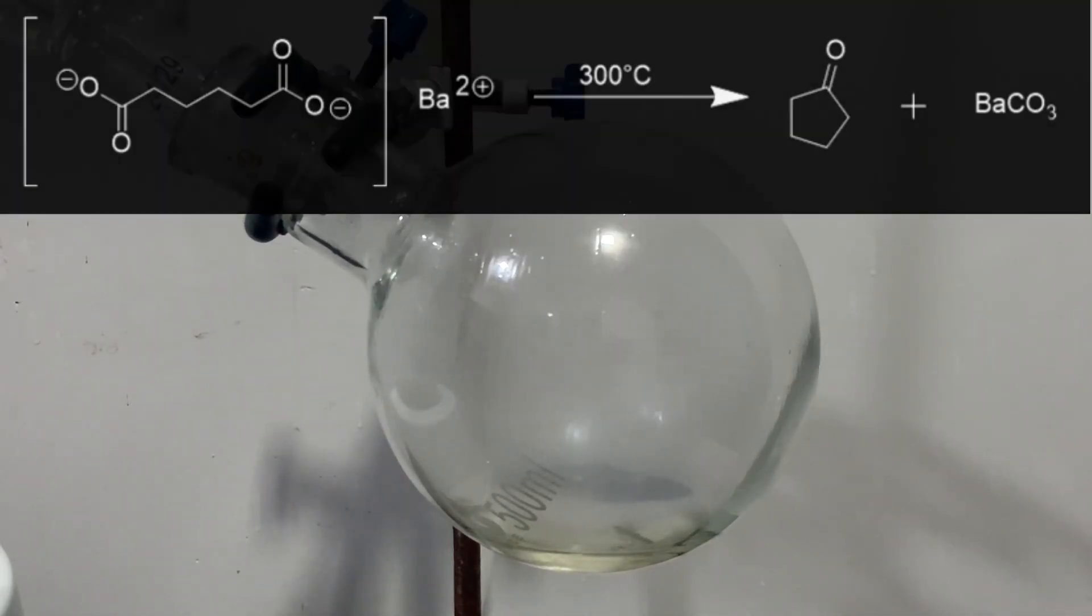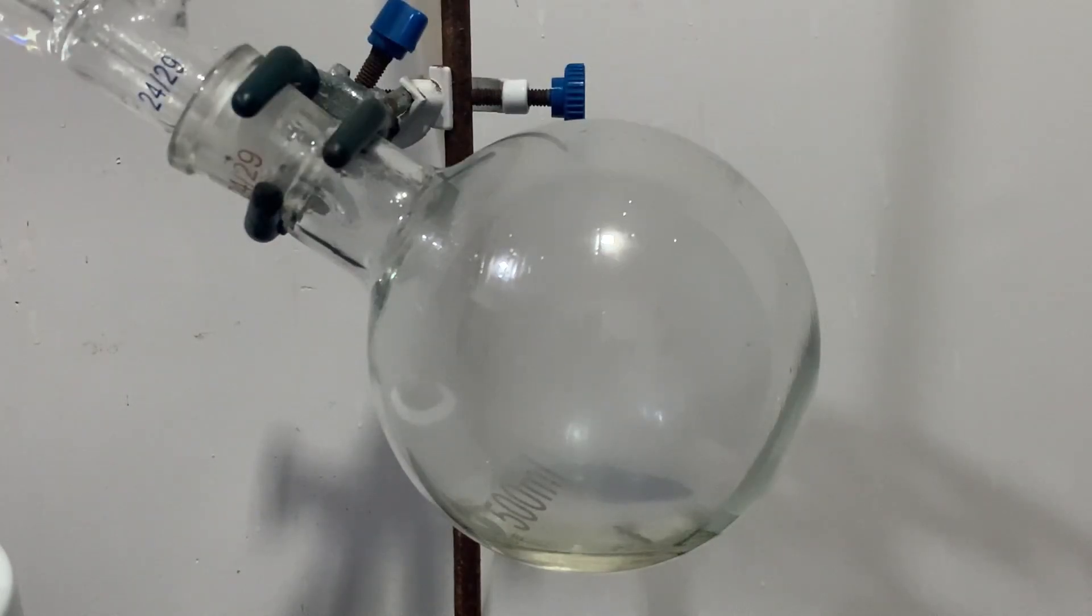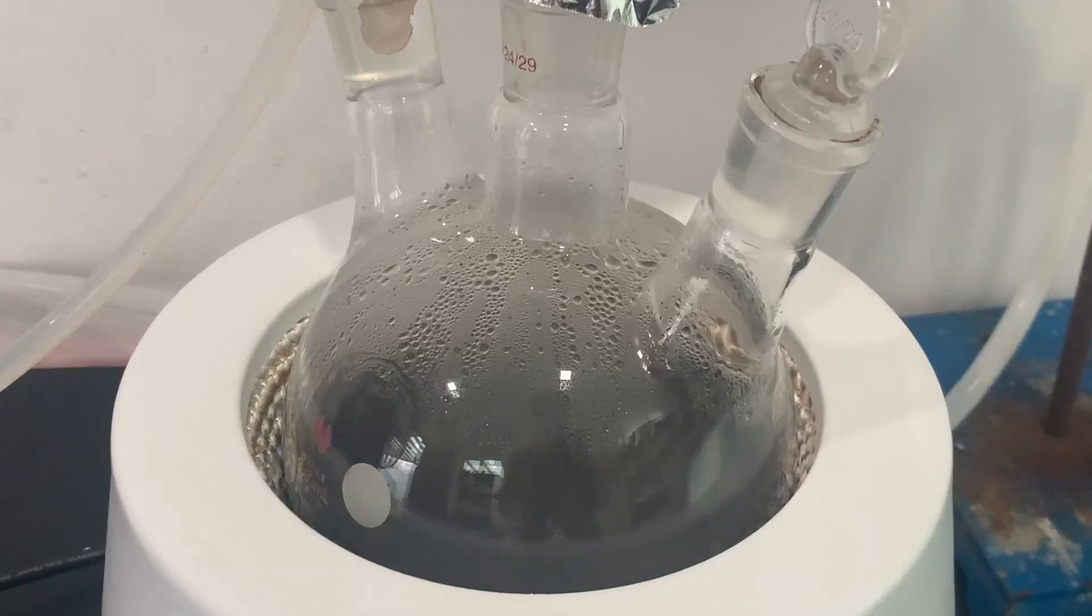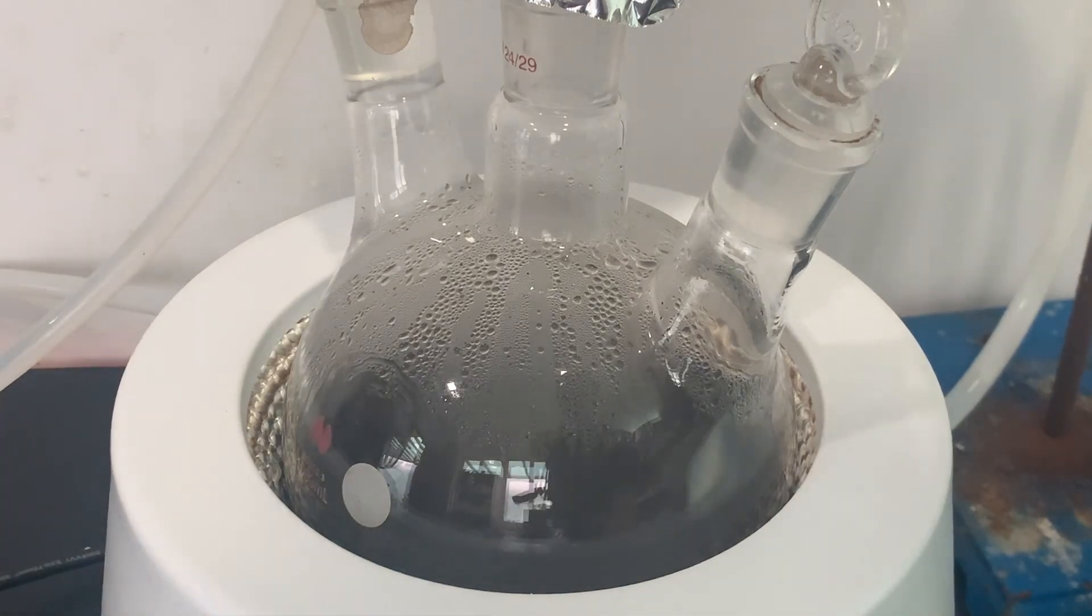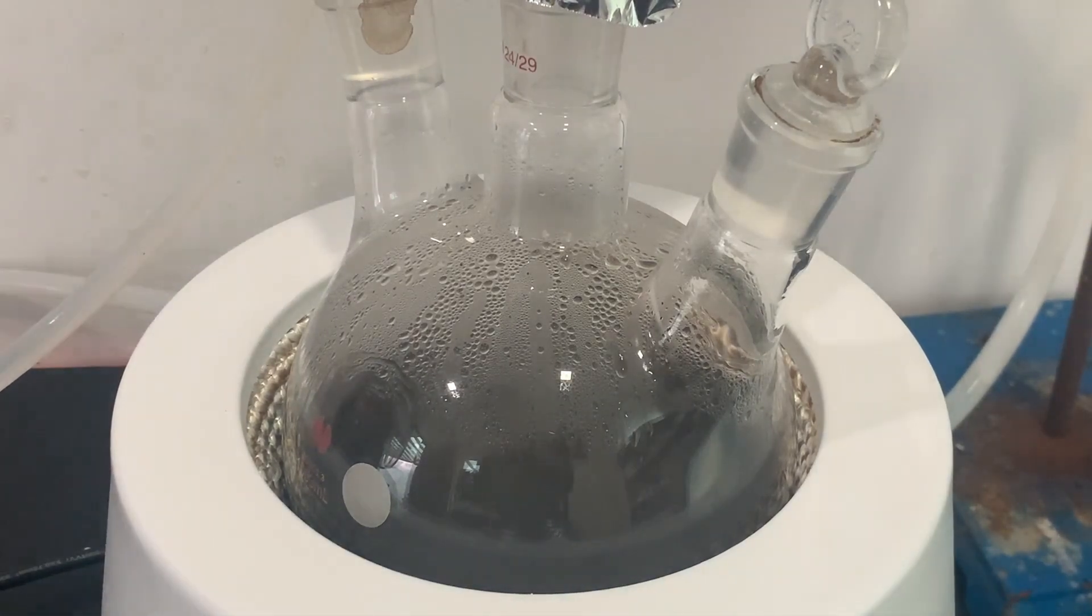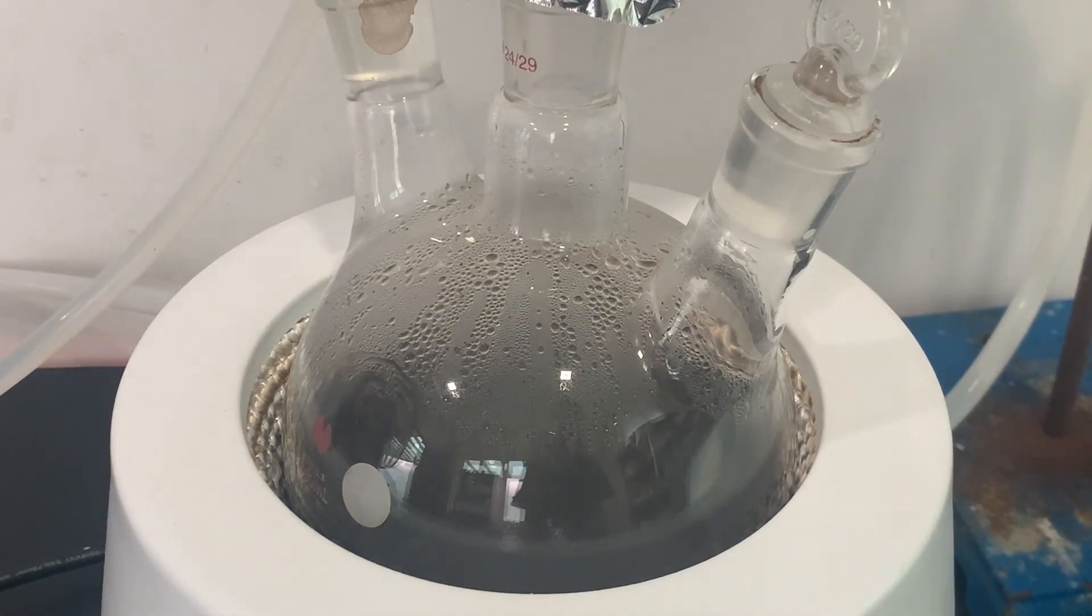The cyclopentanone boils off and is collected in the receiving flask while the barium carbonate stays in the one liter flask. Once there is little to no adipic acid left in the flask, heating was turned off and everything was allowed to cool back down to room temperature.